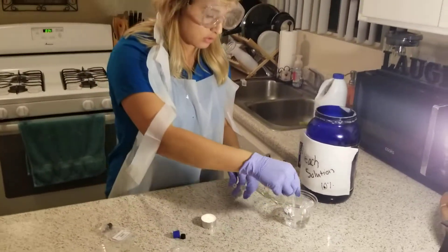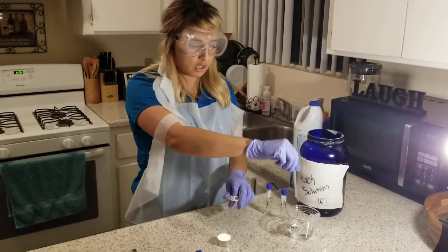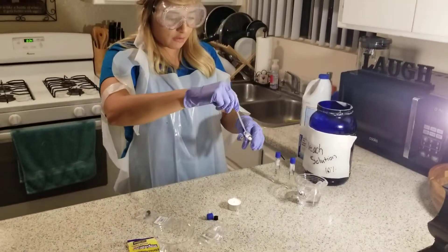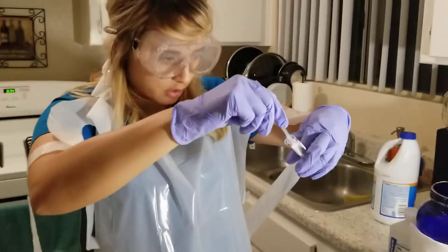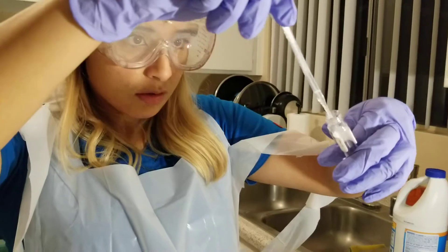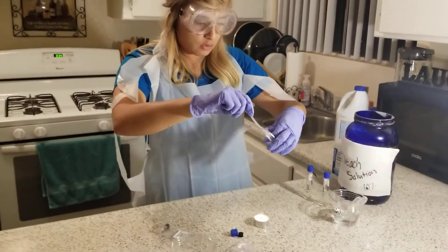Then I'm going to use the alcohol. I have three pipettes in alcohol to keep them sterile. I'm going to collect 0.25 mL from the nutrient broth — that's 2.5 on the pipette — and then I'm going to insert it into the culture vial.